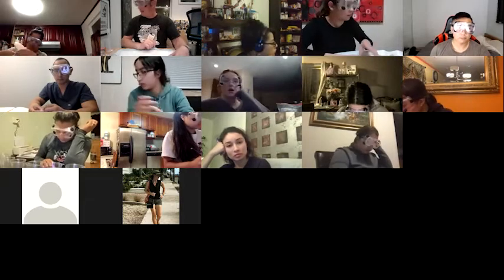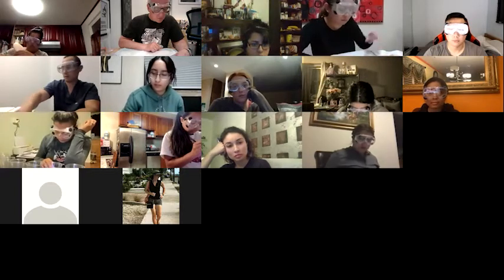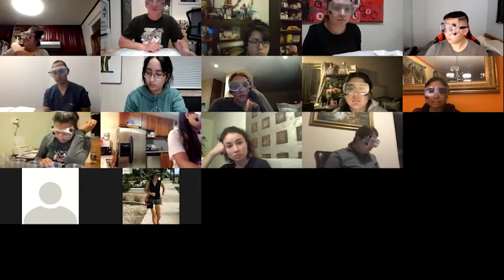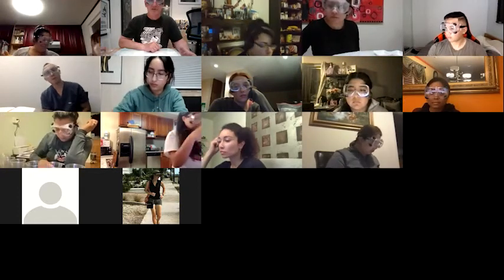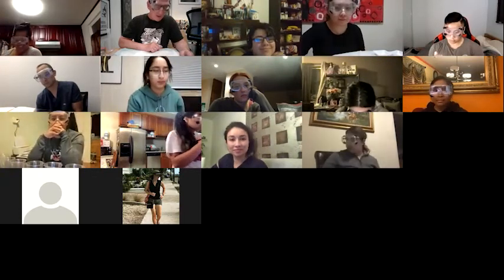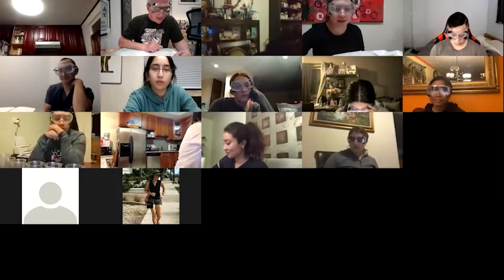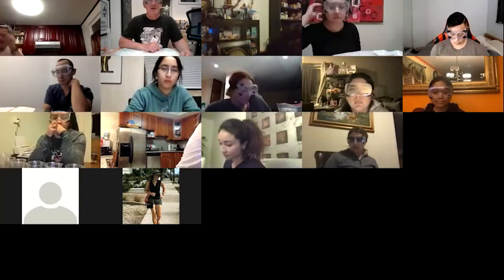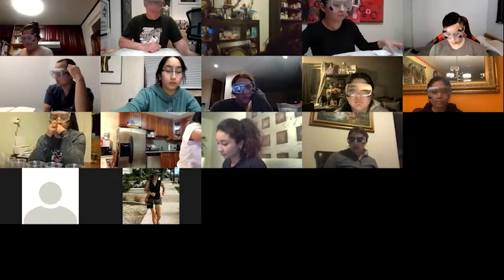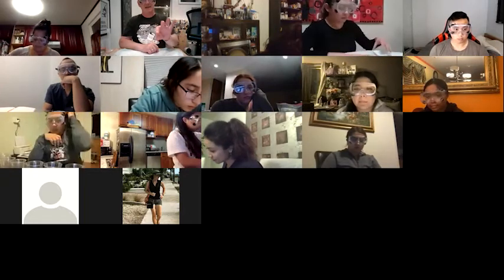Now these things were made for a lot of different stuff. These are actually jewelry scales. So if it says CT, that's actually carats. So if your significant other bought you a ring and you're wondering whether they actually love you, you can just measure the actual carats there. They might be liars. The other thing is GR. GR stands for grains, which is a really old timey English unit of measurement that some people still use for some reason. So you just want G, okay?